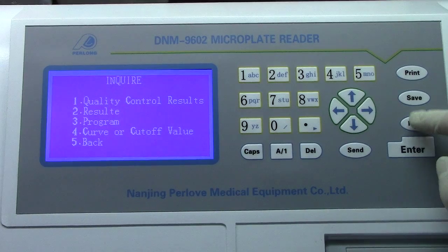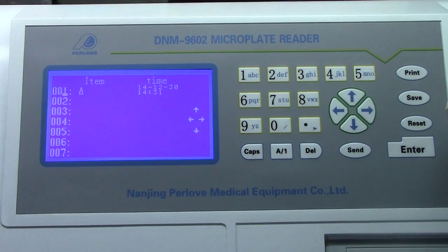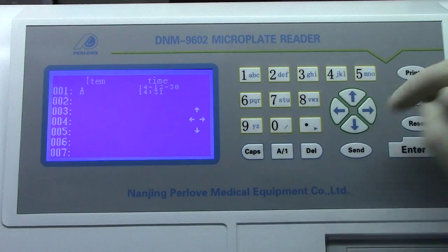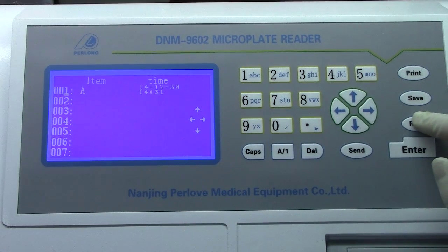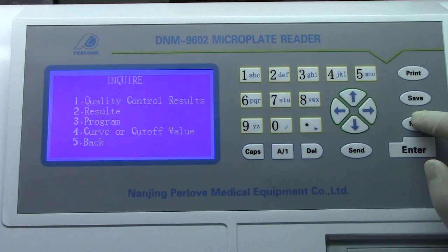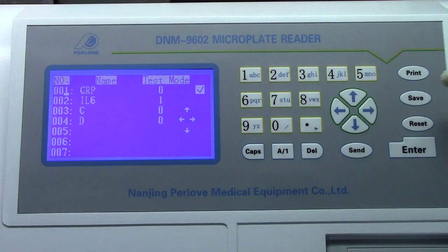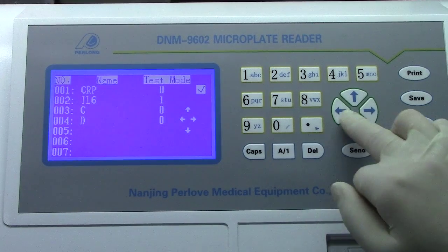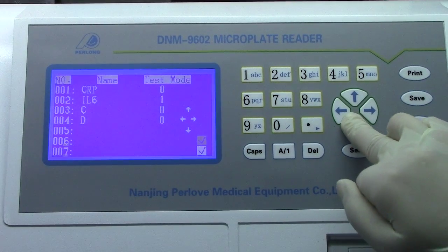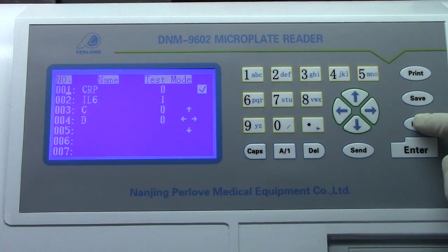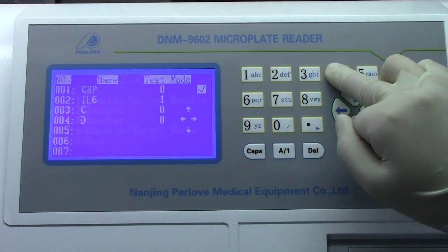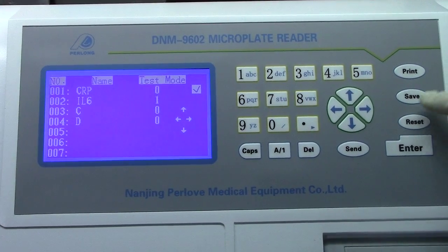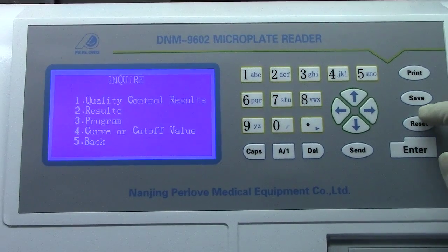Let's go back to result — press 2. We just detected number one sample, so there is only one result. If we have many results, we can search one of them. Press 3 for program — we only have 4 programs input. If we have more programs, we can use this way to search them very easily. Press 4 for curve or cut off — because we have no such curve, there is no information about it.